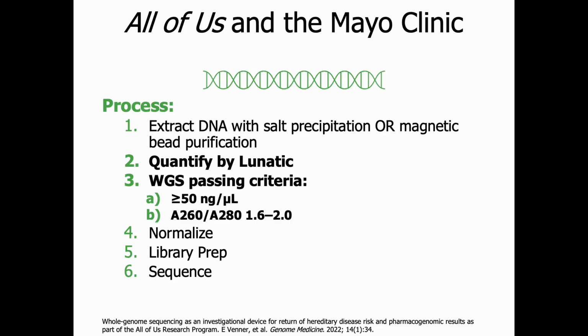This ongoing project required an investigational device exemption from the FDA, and the team published a 2022 paper detailing that validation process, including how the Lunatic was used for sample QC.